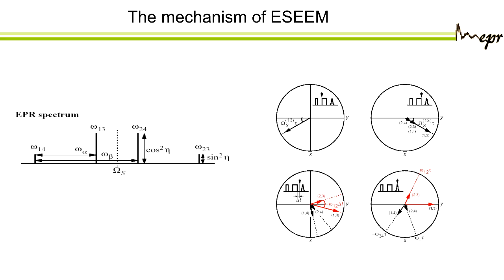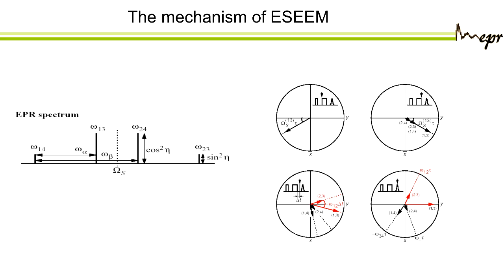So you remember that we have this forbidden transition. In principle, what we will have when you do this experiment, so you give your first pulse, and then you bring your magnetization to the XY plane. But remember, there was this term in the Hamiltonian that was SZIX. So this is really mixing the nuclear state, so it's almost like giving a pulse on the nucleus. So what happens is when you give the 180-degree pulse, then you get what you call branching transition. So you will not stay on the same frequencies, but you will branch to all these other frequencies of the forbidden transitions, and eventually you will refocus only the allowed transition, but some magnetization was lost to the forbidden transitions.